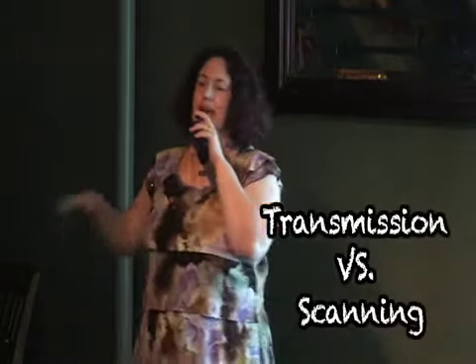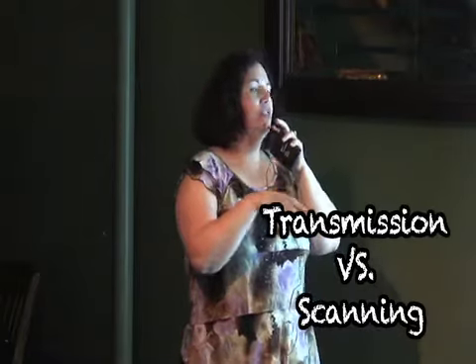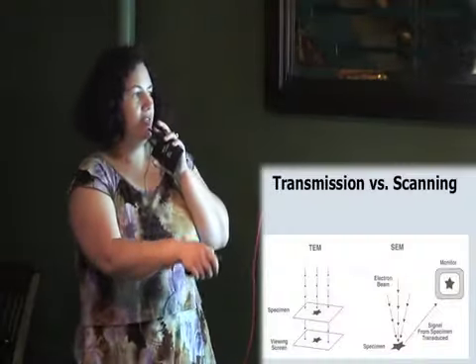And lastly, I want to talk about the difference between two types of electron microscopes. What we call the scanning, that maps the surface, and the transmission. So transmission, like we saw with the optical microscope, you can have the light passing through the sample. In the transmission, that's what we do. The electrons will pass through the material and hit the detector.